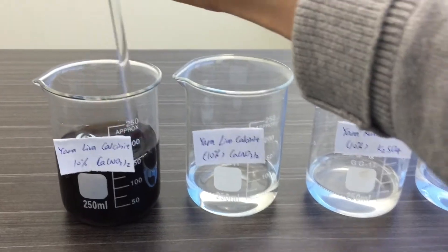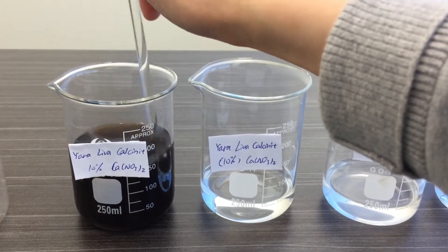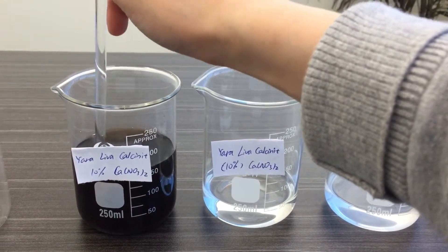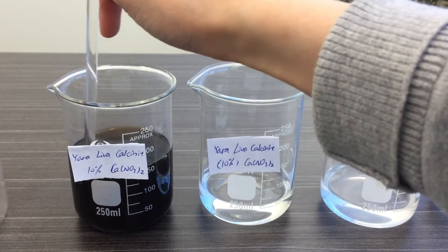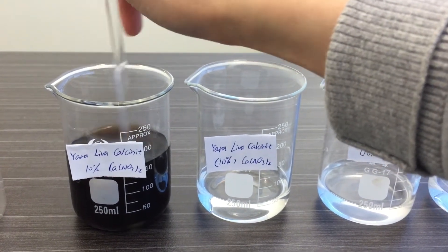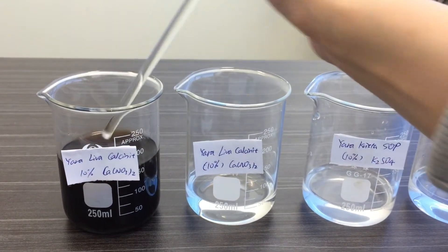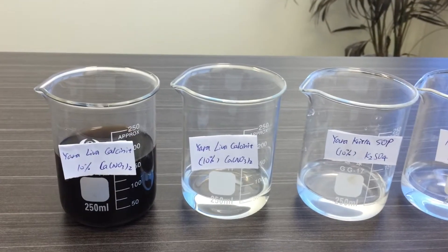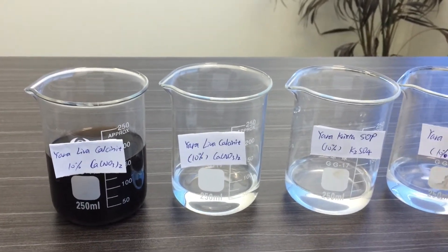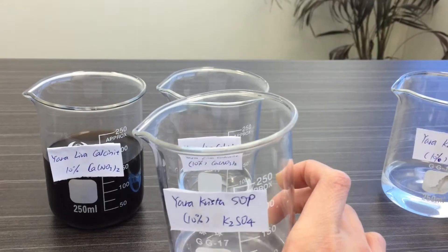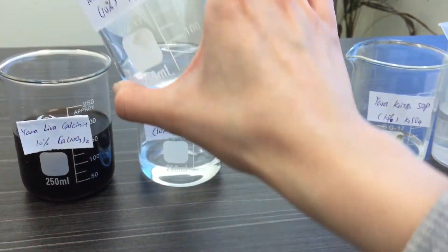I'm going to use a stirrer to stir it thoroughly so that the polysaccharide is able to chelate the calcium ions, and then I'm going to take one beaker of potassium sulfate and pour it into this solution.